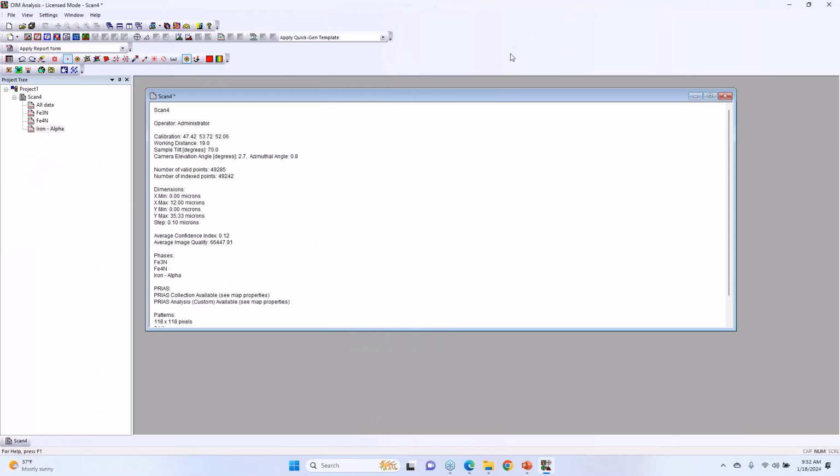So the question is, would we want to try dictionary indexing when there's fewer points? It's a great question. I really don't have a great answer. So far, no, I haven't.